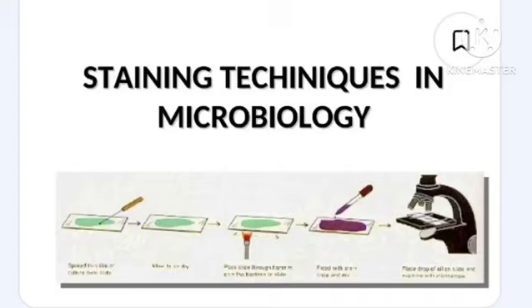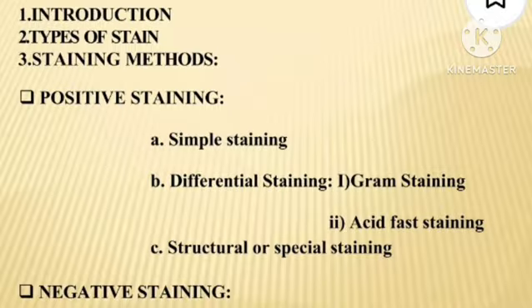So today we are discussing staining techniques in microbiology. What is staining? Staining is a fundamental laboratory technique used to make microscopic organisms, cell populations or tissues highly visible under the microscope.